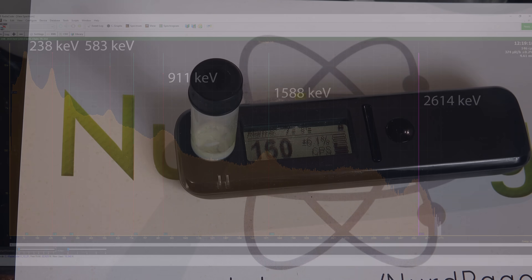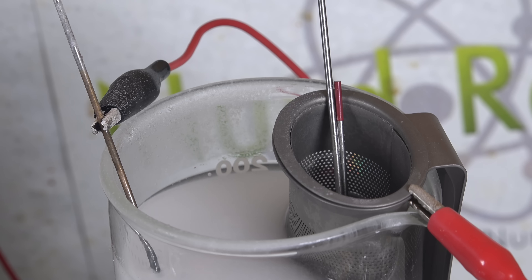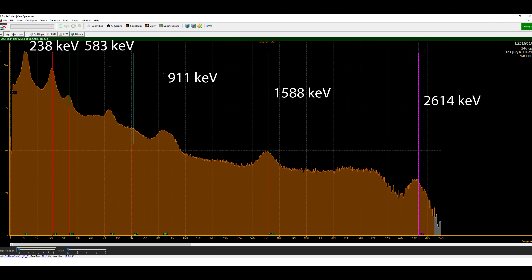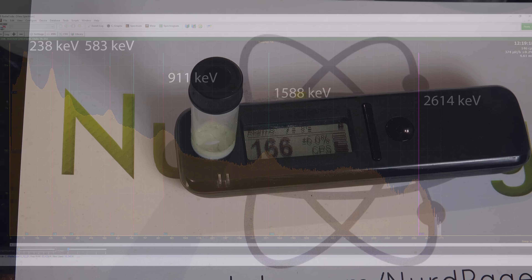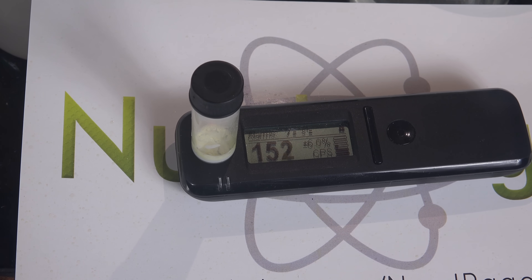So back to my first vial — I was able to get a nice clean spectrum from my RadiaCode in several hours rather than a few days. Now an interesting point about the thorium gamma spectrum is that these peaks are not directly from thorium, but actually from the daughter products, most of which is radium. Fortunately this alkaline electrolytic processing method retains the radium, so we still get all these good peaks. But keep this in mind if you try modifications or alternative processing techniques — if you lose the radium the spectrum will change a little bit. I'm thinking I might try and separate the trace amount of radium from the thorium dioxide, but let me know in the comments if there is interest.